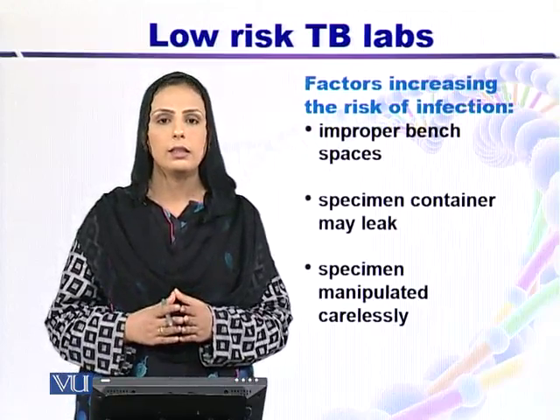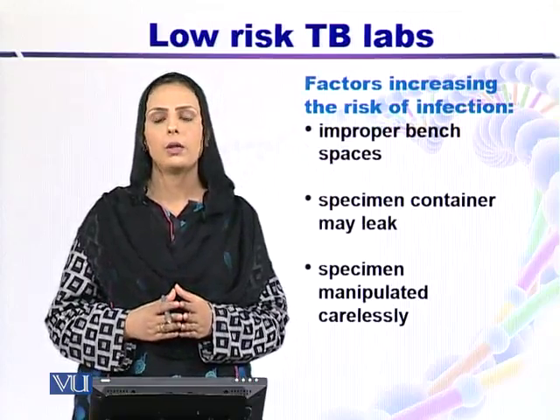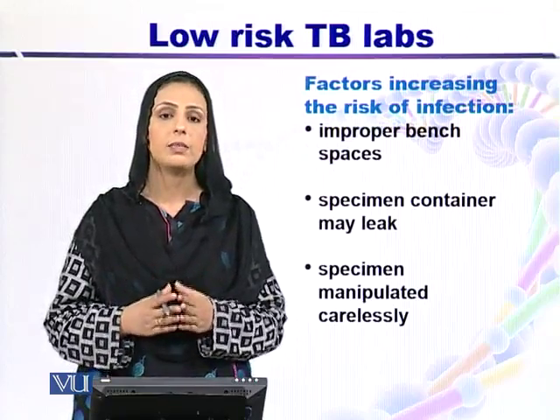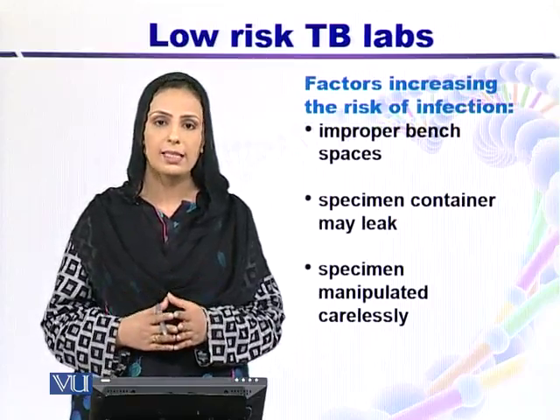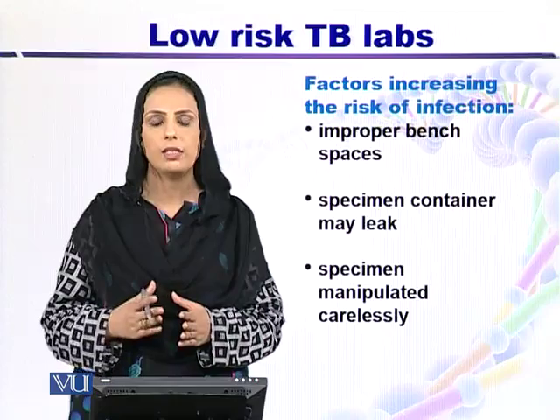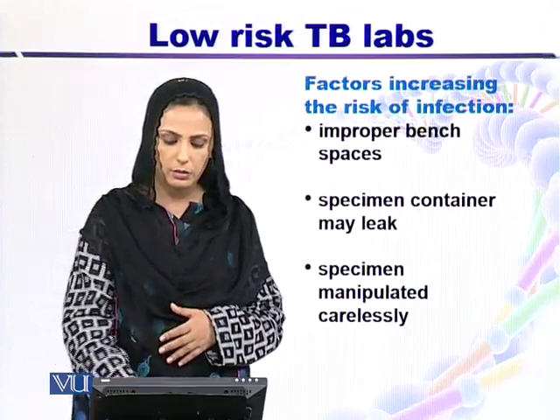The third factor that increases the risk of Mycobacterium tuberculosis spreading is when the specimen is manipulated carelessly, when good microbiological practices are not followed by the workers. So this is again a chance that the low risk TB labs move towards high risk TB labs.